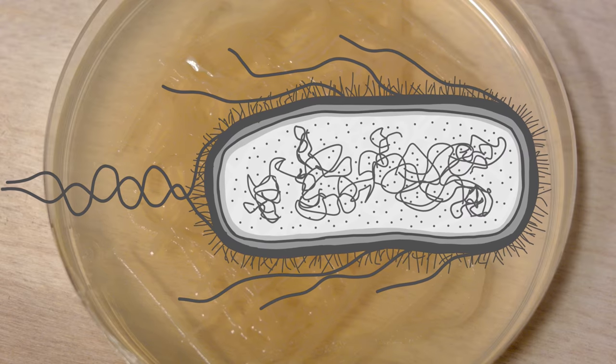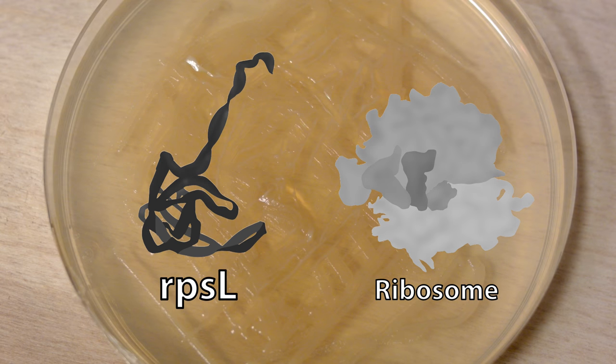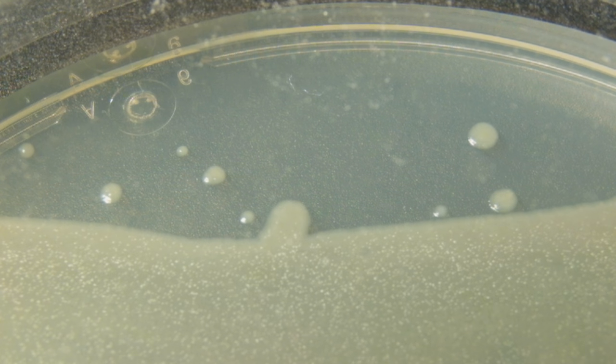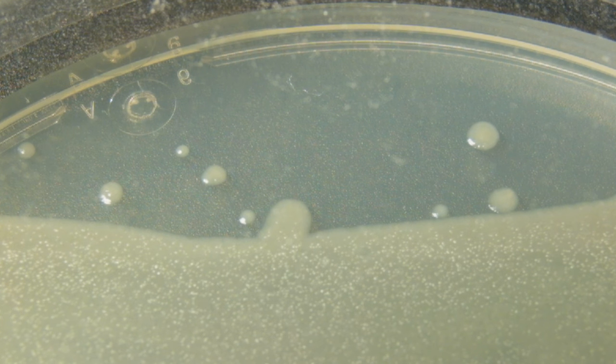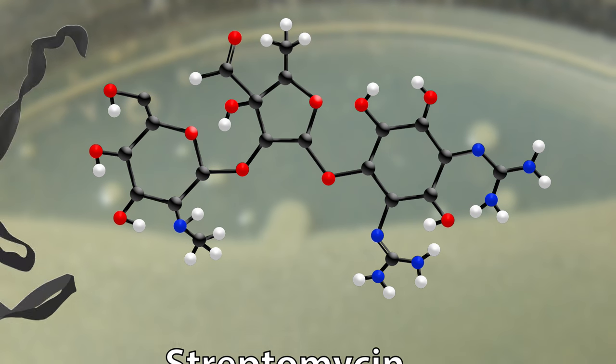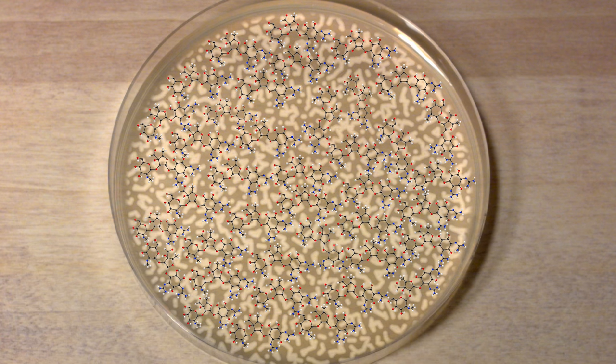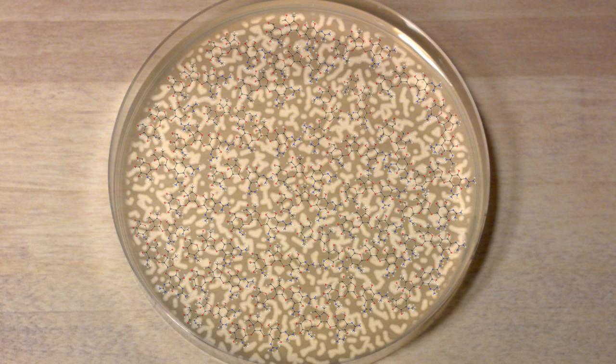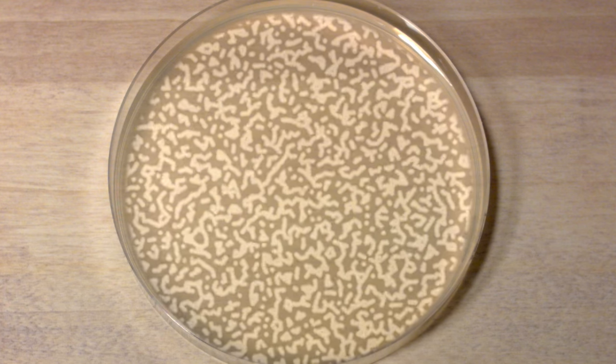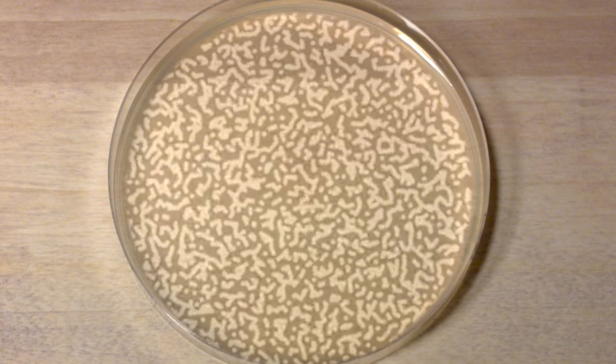The goal for the E. coli CRISPR experiment is to make a precise edit to the protein RPSL, or ribosomal subunit protein. The modified E. coli will be grown on agar plates that contain streptomycin, an antibiotic which normally binds to the RPSL, preventing the production of proteins by the cell's ribosomes. Without proteins, the E. coli can't grow and replicate. This modification now imparts E. coli with antibiotic resistance by preventing streptomycin from binding to the RPSL.